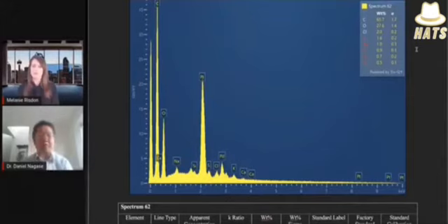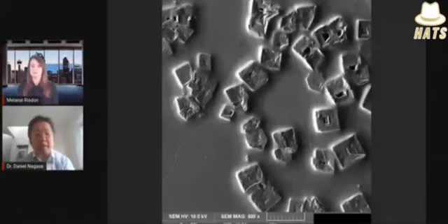So then let's move on to the next file so we can get a closer look at those things that look like little eggs or little round spheres. Was that in the same file or do we need to switch to another one? We need to switch to the next file. Okay. And this is all in the Moderna. So we're seeing multiple different shapes showing up in the Moderna vaccine. This one's actually the Pfizer picture. So those little shapes were from Pfizer.